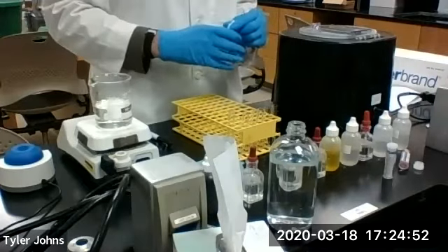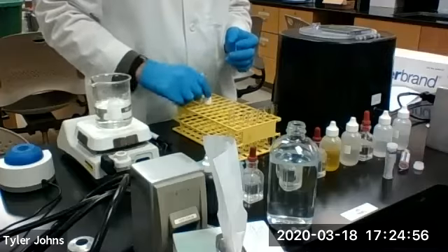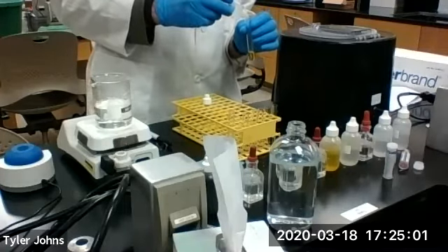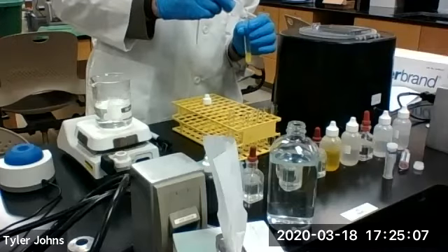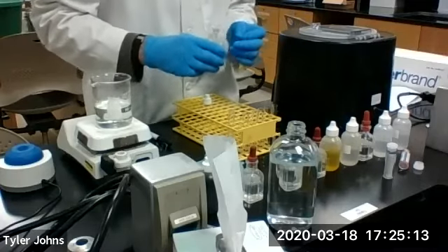We're going to be adding 10 drops of this to S15. As you can see, we already have a precipitate forming.